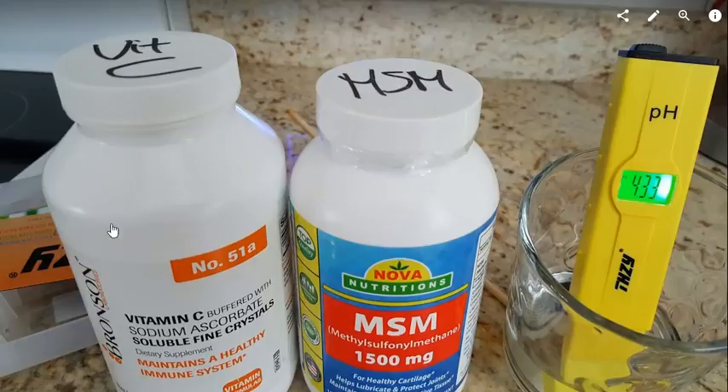They sell it as a buffered solution, so I thought "buffered" means it should be neutral — like pH 7.0 — but it obviously is not.